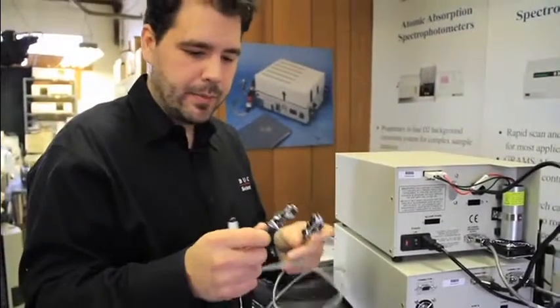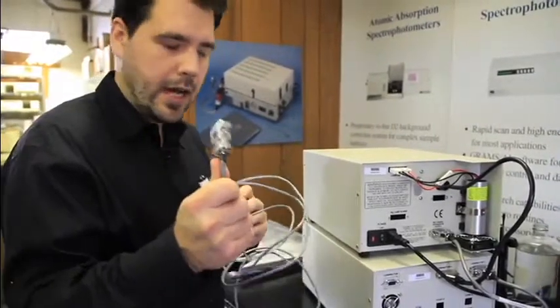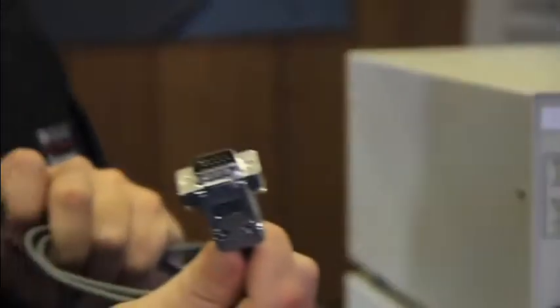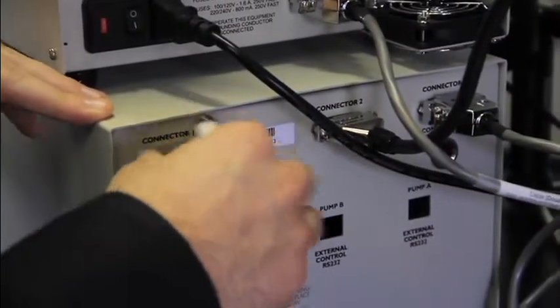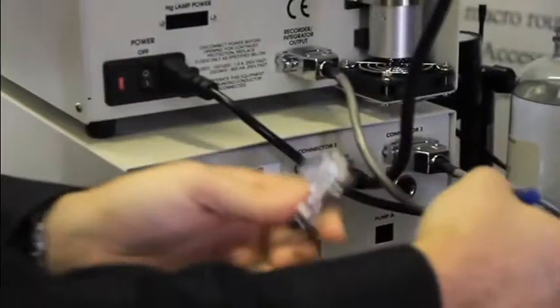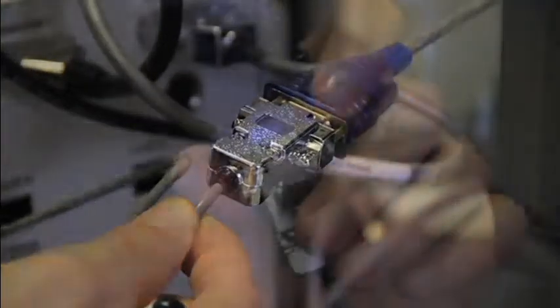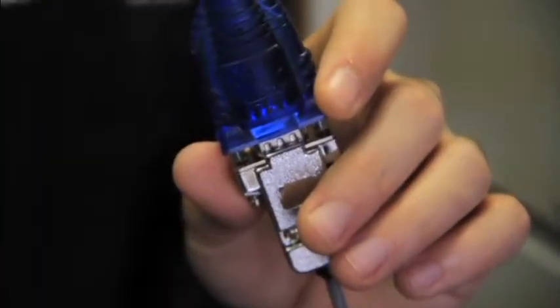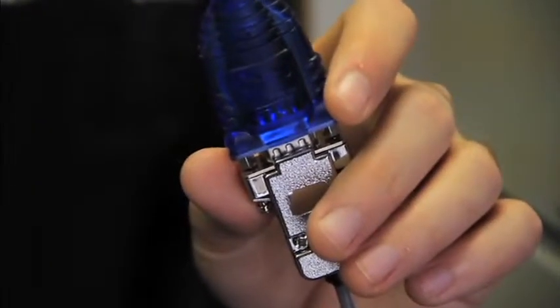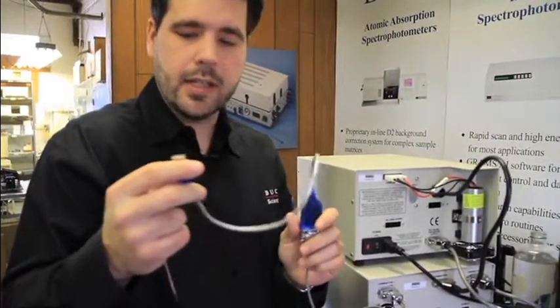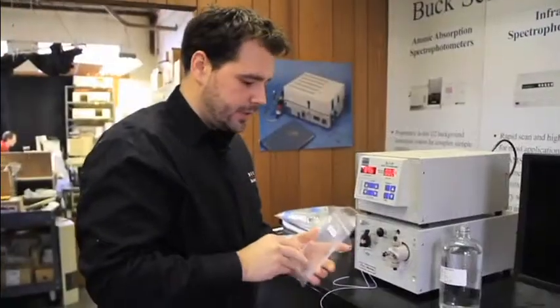The final connection that needs to be made is the detector output to the computer. There's a male end with 15 pins and a female end with 9 pins. The male end goes on connector 1 on the pump chassis, and the female end goes to a serial cable coming from your computer. If your computer does not have a serial cable, we also offer USB adapters, or you can purchase them locally at many electronic stores.